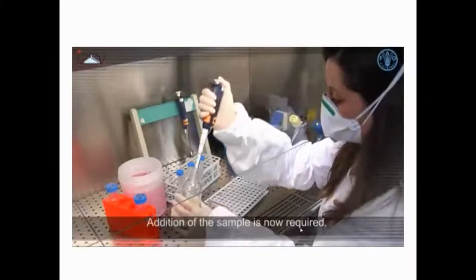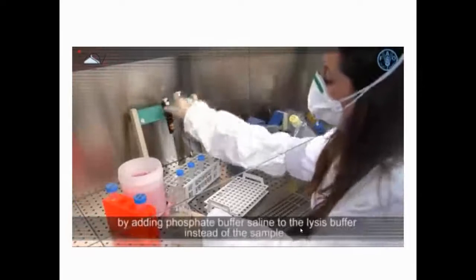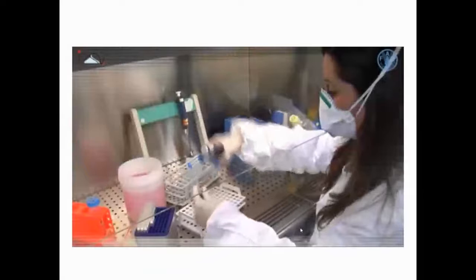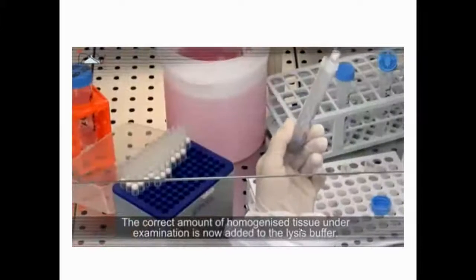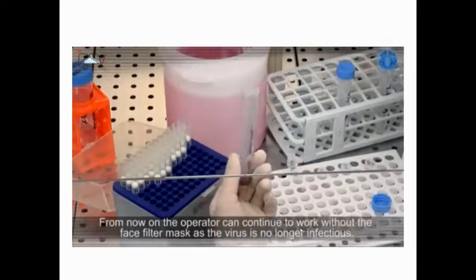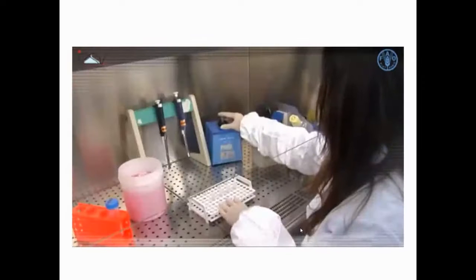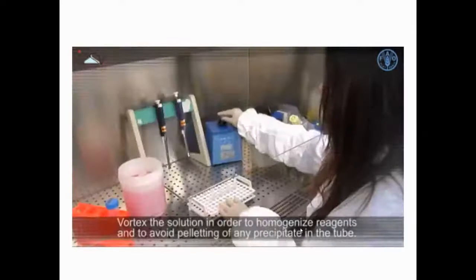Addition of the sample is now required. Note that for each batch of samples, a negative control should be included by adding phosphate buffered saline to the lysis buffer instead of the sample. The correct amount of homogenized tissue under examination is now added to the lysis buffer. From now on, the operator can continue to work without the face mask, as the virus is no longer infectious. Vortex the solution in order to homogenize reagents and to avoid pelleting of any precipitate in the tube.